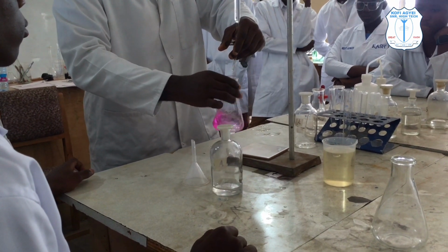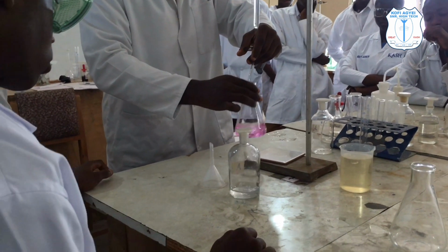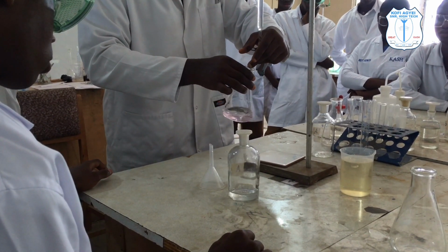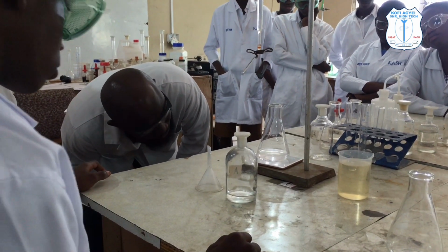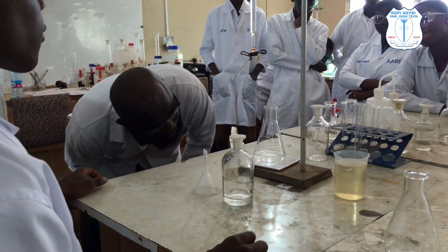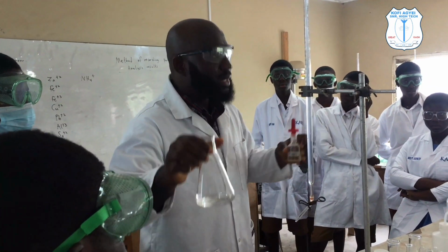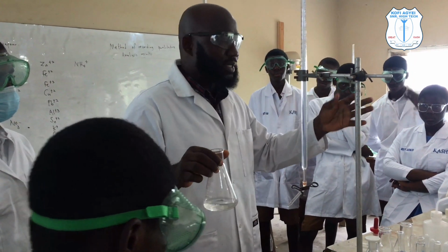Now what is happening? So when you get to this point, take your time. You put it on the white tile to check. I believe there's still purple or it's colorless. It's not colorless, right? No. So we've got now a color change. When you use the phenolphthalein, it changes from purple to what? Colorless. What about methyl orange? From yellow to what? Pink, or from yellow to what? Orange. Yes.